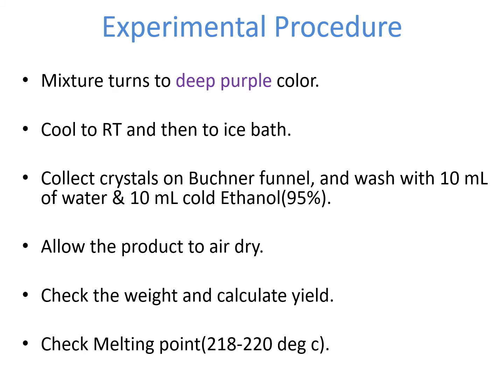And this deep purple color solution can be cooled after 15 minutes, and then once it is at room temperature, we can further cool it in an ice bath, and we can then wash the solution to get crystals.